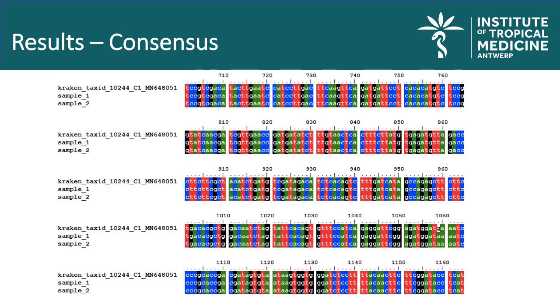The pipeline is also producing an alignment between the consensus sequence and the reference selected in order to allow the user to check the quality of the consensus. The pipeline stores the mapping file in BAM format, which was used to produce that consensus. Then the user can visualize the consensus quality using some alignment viewer for BAM files such as IGV.